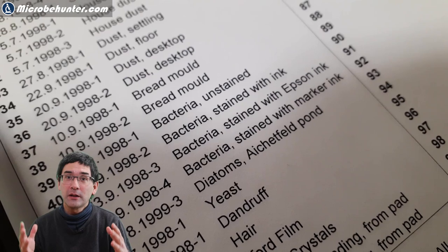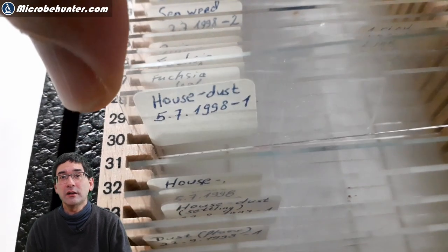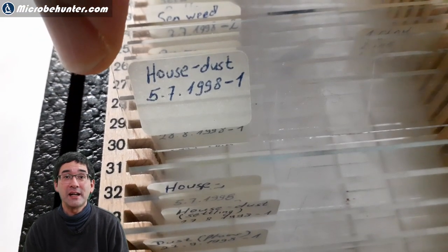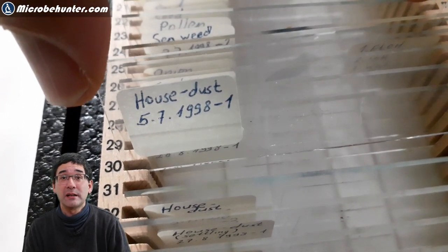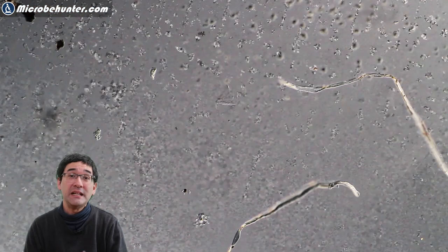At that time I essentially made a whole bunch of permanent slides using pretty much anything I could find. I was of course also collecting dust samples, pollen grains, insect wings, all sorts of things. And then all of a sudden I saw, in one of those dust samples, I found this strange structure.